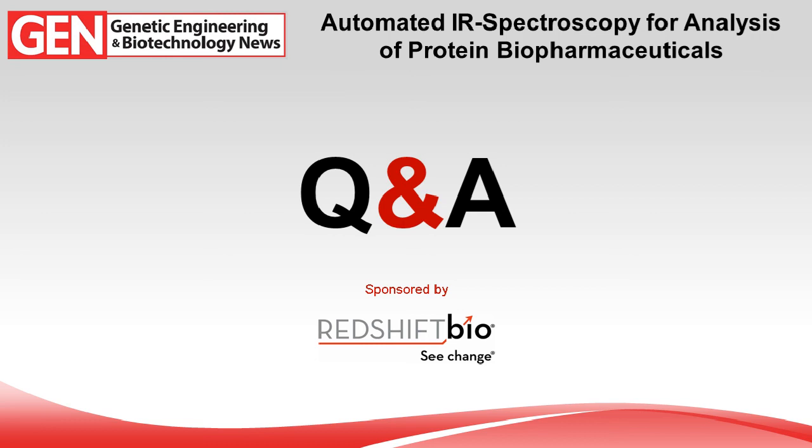Yes, that's a very good question. Right now, we are intensively investigating one of our products, which changed from a lyophilized form in a vial presentation into an injectable pen presentation, a drug product presentation.